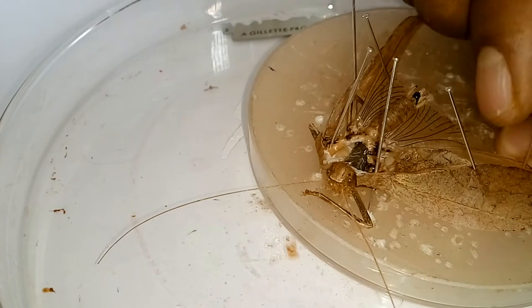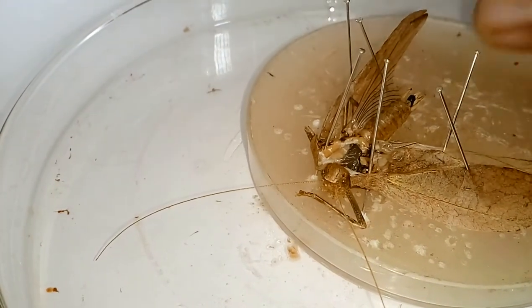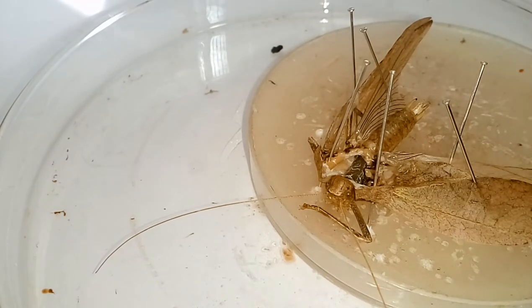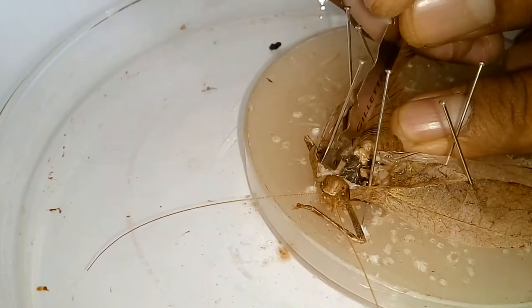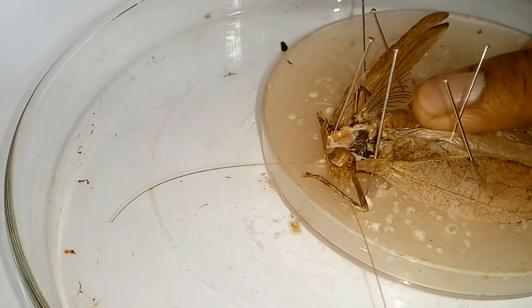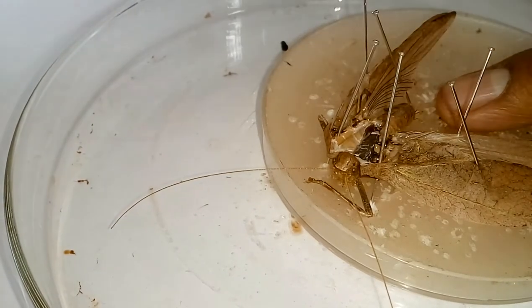Now again utilizing the blade, we go for another cut in the body and it is now time to dissect the abdomen. It is a male grasshopper because the female of the same family has a long sword-like ovipositor. I am just cutting the abdomen, and during cutting we have to take care not to tear other parts like the reproductive system.